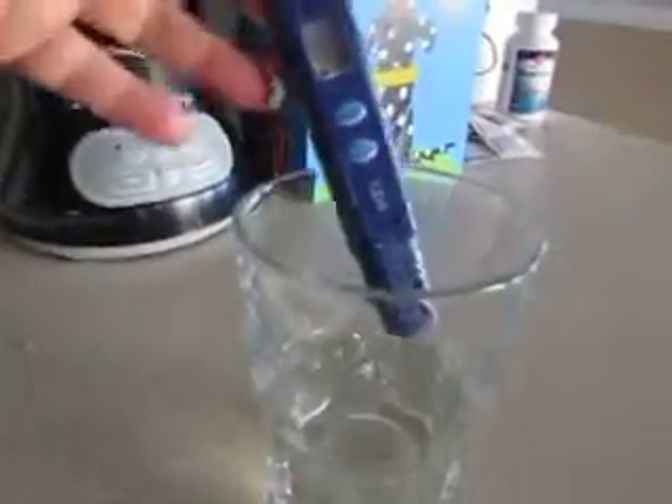They gave me this instrument that measures the yucky stuff in my water, and I'll go over that in a minute. My tap water seems to register at 26 ppm.